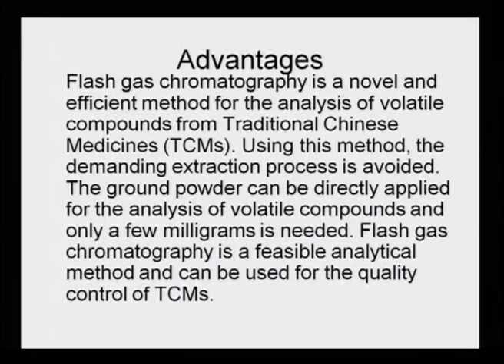Advantages of flash gas chromatography: it is a novel and efficient method for the analysis of volatile compounds from traditional Chinese medicines. Using this method, the demanding extraction process is avoided. The ground powder can be directly applied for the analysis of volatile compounds and only a few milligrams are needed. Flash gas chromatography is a feasible analytical method and can be used for the quality control of traditional Chinese medicines.